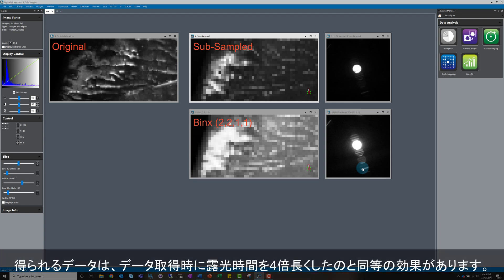We expect a result that's similar to increasing exposure time by a factor of 4 for the same experimental conditions on the microscope.